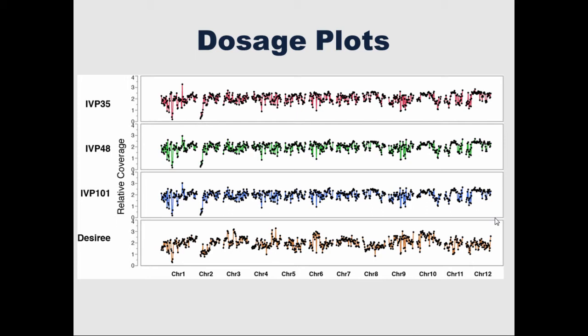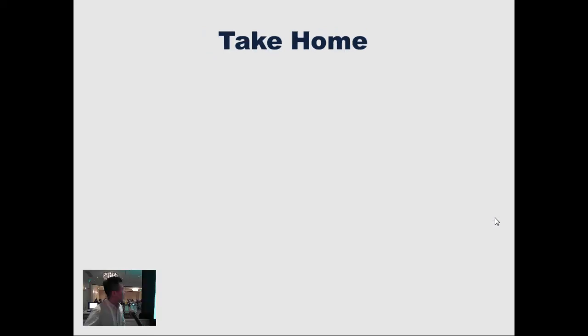The draft genome for potato was a double monoploid that was closely related to the Freyas. But so I just made a plot of all the parental lines. This is the tetraploid potato. And what we can actually see already is that there are structural changes in dosage when you map it to the genome. So we're going to slowly try and tease this out, and we actually have these extra additions in the tetraploid potato as well.